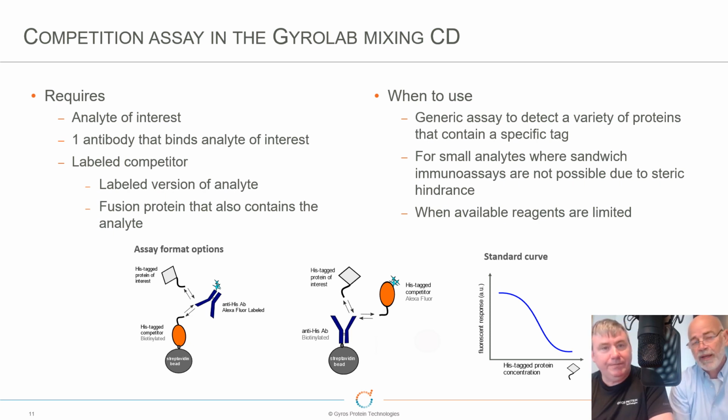Yeah, it really automates that process of adding your reagents together and giving them some incubation time, and then using the same column chromatography to do your affinity purification step. And I think we talked in the previous slide about pre-incubating the capture and the analyte. Another way to increase the contact time of reagents is to use the mixing chamber to allow the reagents to bind to each other. And we're very flexible on time. You can alter the time of incubation and mixing, so you have a lot of flexibility.